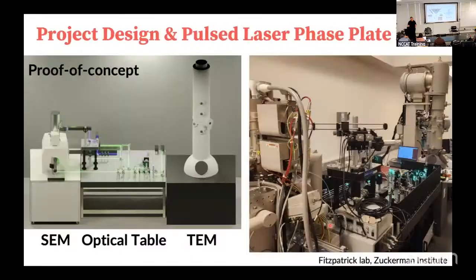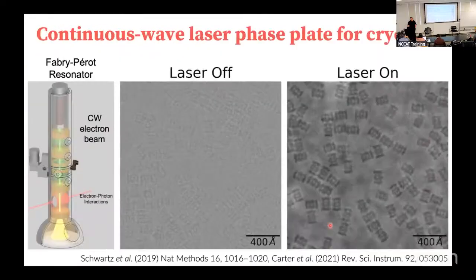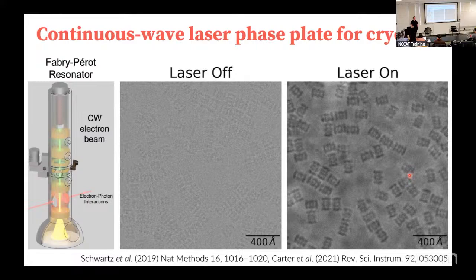They have some aberrations there. They also have things called ghost images that happen, which I kind of alluded to in the timing aspect. So when you time things, we predict that you would have fewer aberrations when it's perfectly synchronized. External and tunable and external. Right. That's right.